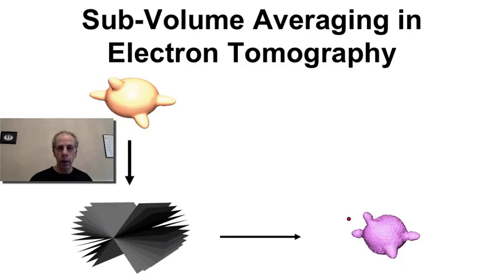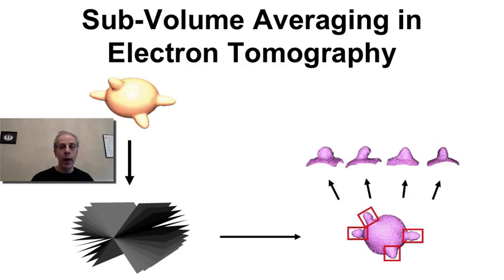And that's what we are going to exploit with image processing. We are going to exploit that we have not one very noisy example, but multiple very noisy examples. So hopefully we can extract them, put them together, and get the 3 dimensions that we want.